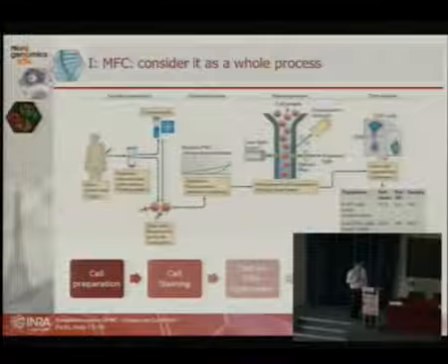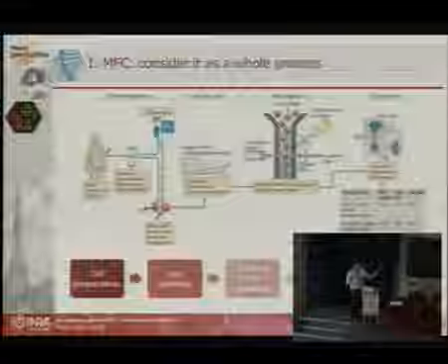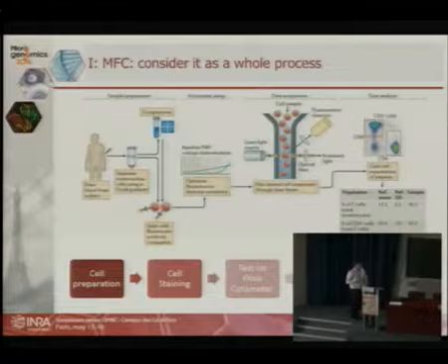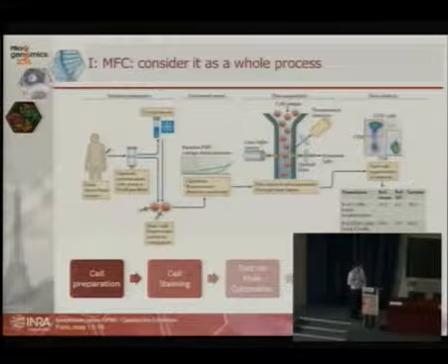Then you can also badly alter the viability of your cells, and of course this is not good for the kind of study you want to do. And finally, if your procedure is very stressful or very lengthy, for sure this will have an impact on the genetic profiling you will look at by transcriptomics.